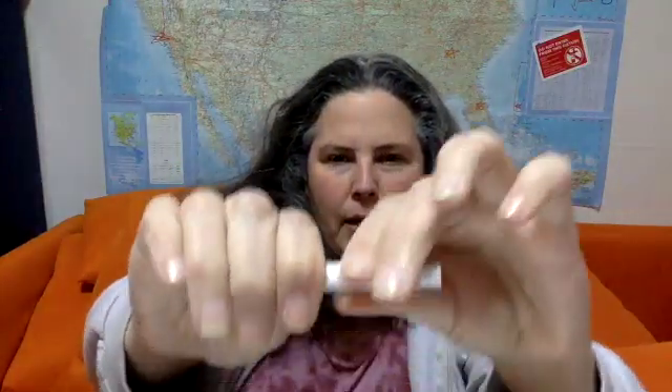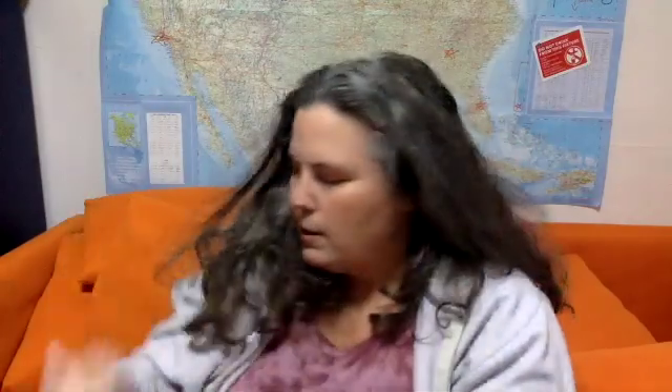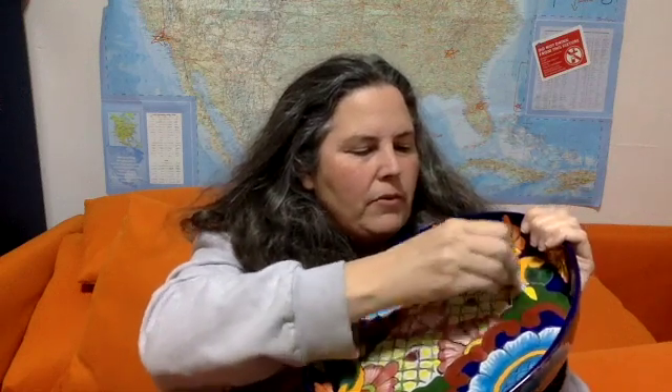Lead free it is not. And I wanted to show you — I haven't tested this with a lead check swab. Here's a lead check swab. I'm just going to test it in front of you so we could determine if it is possibly bioavailable. And just pull this out so you can see the yellow.